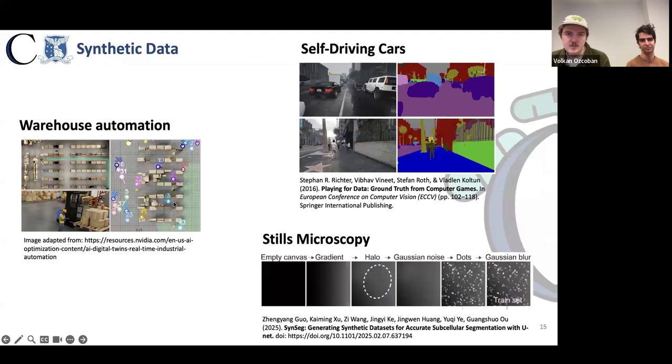Our solution to this was to use synthetic data as a placeholder. It meant we could quickly work out if any approach we tried was just bad or it just didn't have enough training data and still could potentially work. It also generates perfect annotations every time, and annotations can be adjusted programmatically for different training targets. For example, we could change the labels if we want to train a model just on semantic segmentation, or we could swap it all to classify punctate versus tubular mitochondria.